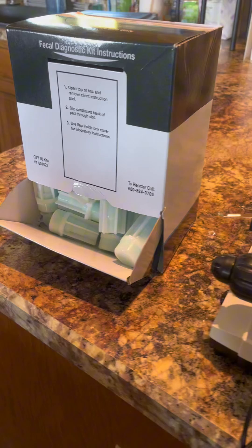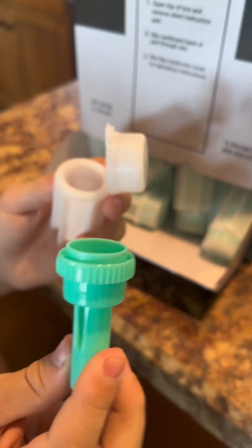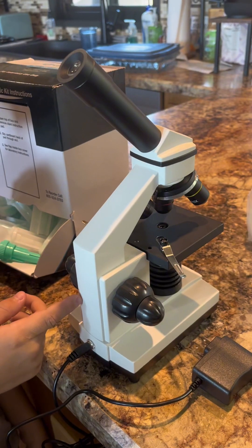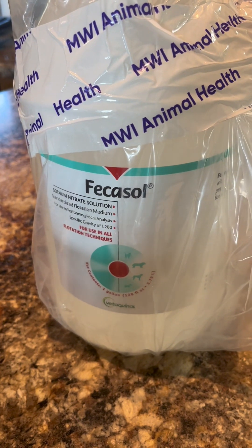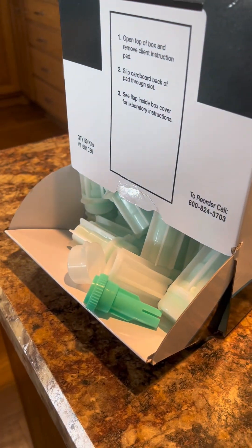Here are the supplies you need. You need fecal kits — these can all be purchased online. You also need a cheap microscope. You need a product called Fecasol, which helps float the eggs to the top of your fecal test kits.